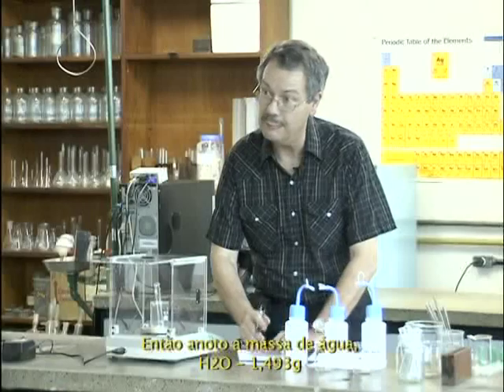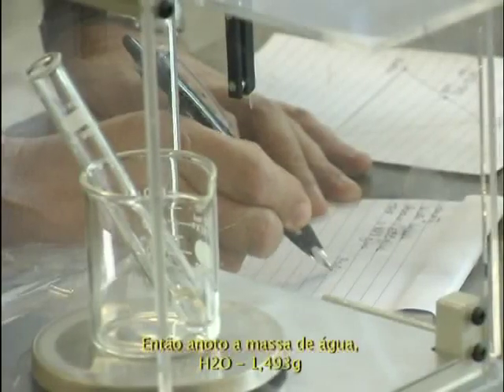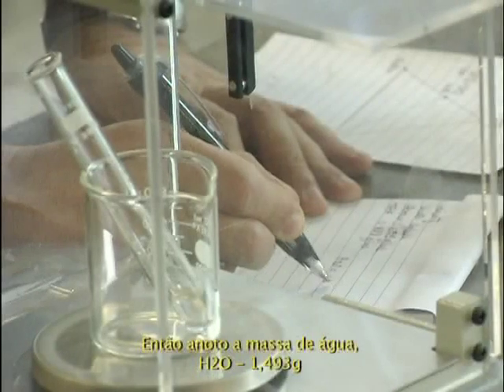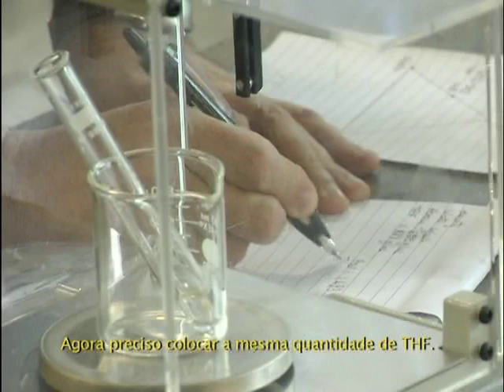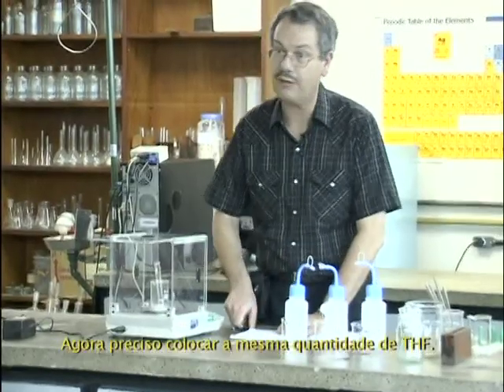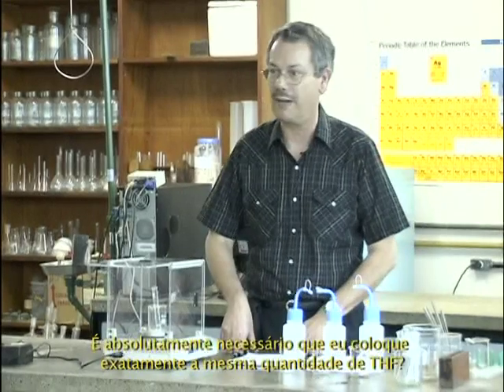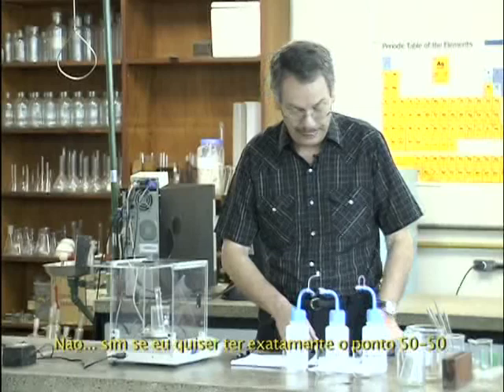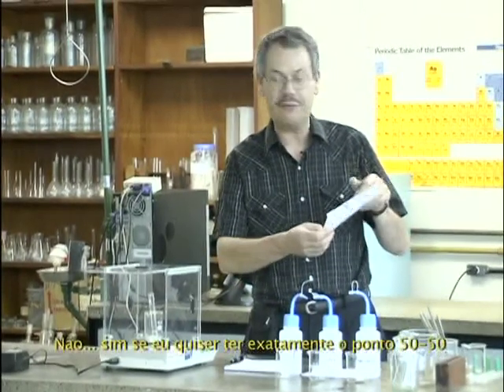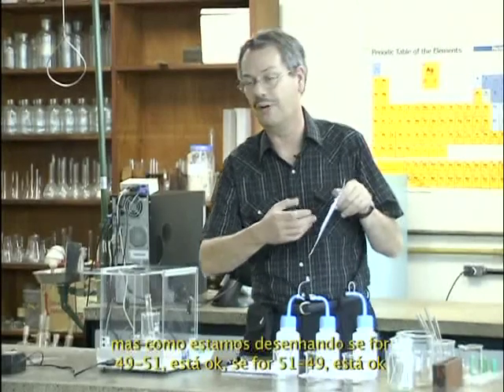So I write down the mass of water I got, water, H2O, 1.493 grams. Now I must put the same amount of THF. Is it absolutely required to put exactly the same amount? No. Yes, it's required if I want to do exactly the 50-50, but since you are drawing it, if it's 49-51, it's okay.